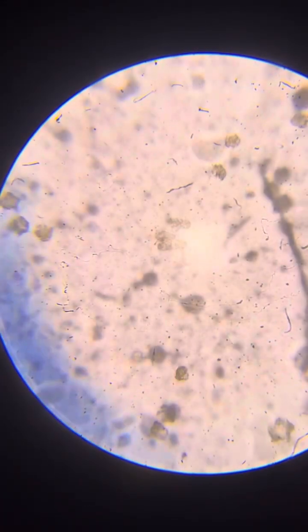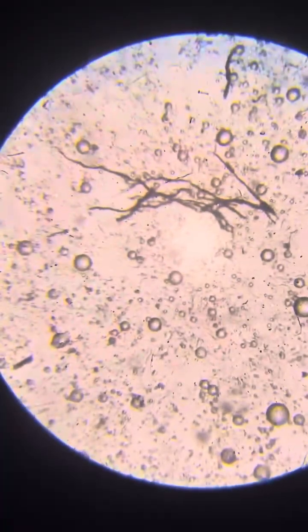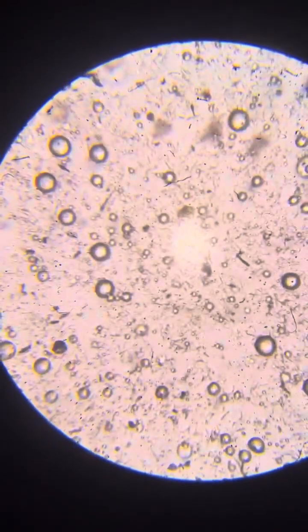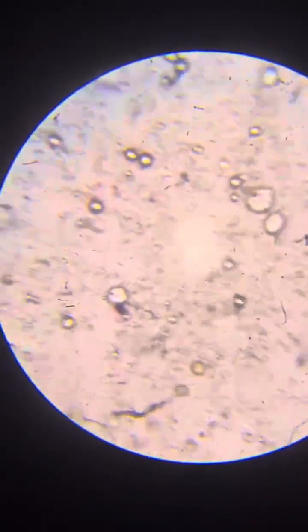This is a 150 magnification, and now we see the new one is much better. We have a good assortment, and maybe it's even as good as the previous one. You know what? Because we do see a tremendous amount now with 150, just that they are very small. But again, a tremendous amount of smaller ones is not necessarily worse than a good amount of bigger ones.